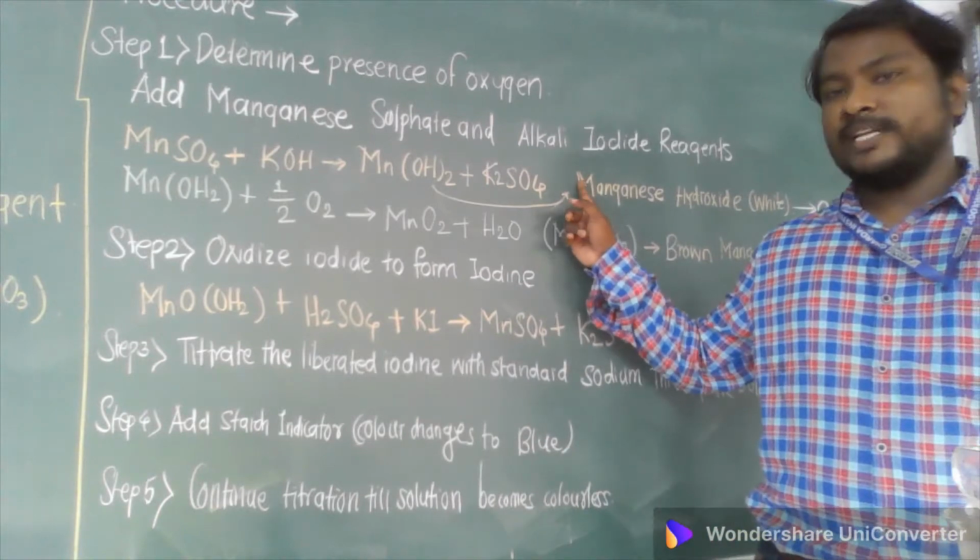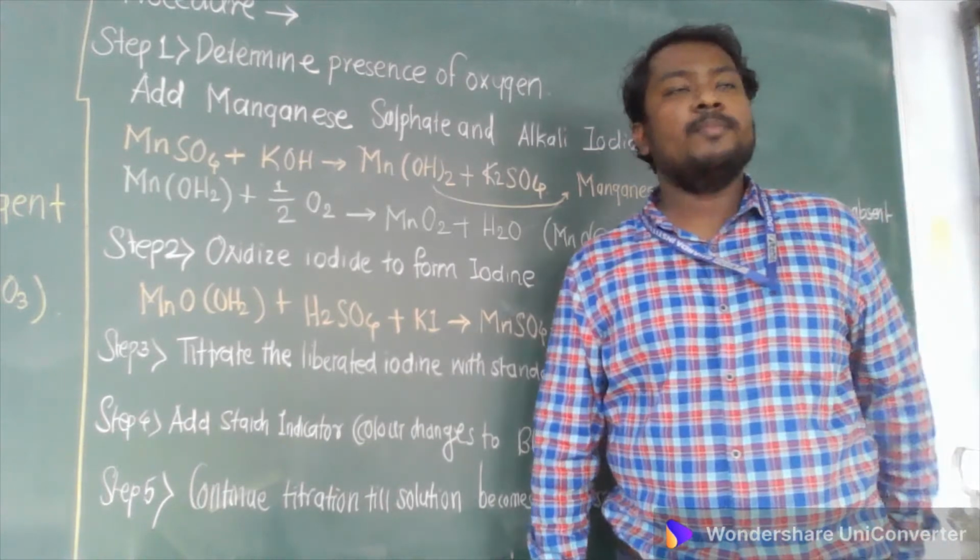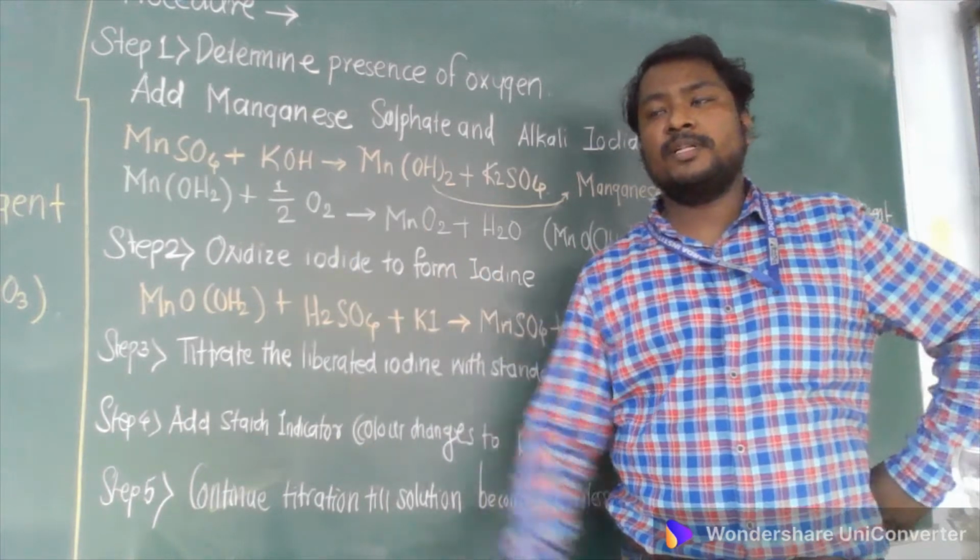Then your step number 1 is completed. You have to follow step number 2. If white color is generated, you have to stop the titration. There is no need to perform further analysis.